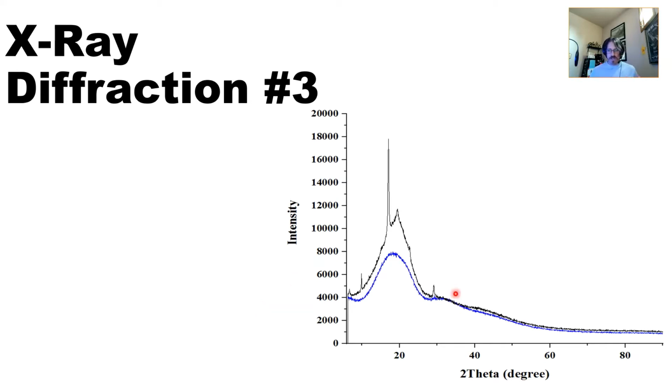And so we have two spectra here. We have this blue line and we have this black line, and there are two different conditions. This blue line is amorphous, and when you see a big hump like this on an X-ray diffraction spectra, that means there's some amorphicity if it's very, very wide. When you see these peaks here, and there's actually quite a few, I don't want to get too far into this research because it'll distract from what I'm trying to get to. But we were actually surprised to see this many reflections.